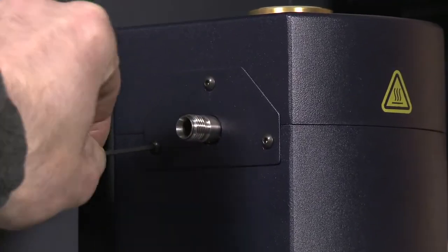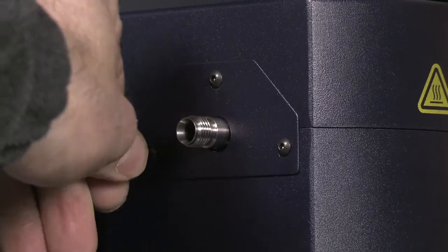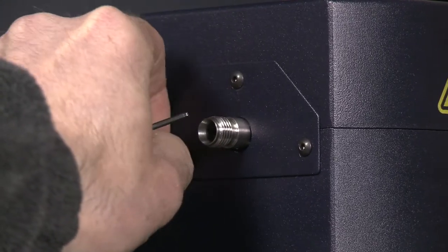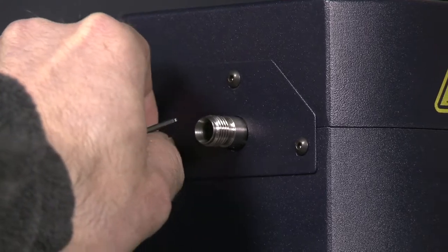We start by removing the standard furnace outlet. Using a hex key, remove the three screws that hold the dress cover in place, then remove the dress cover exposing the exhaust outlet.